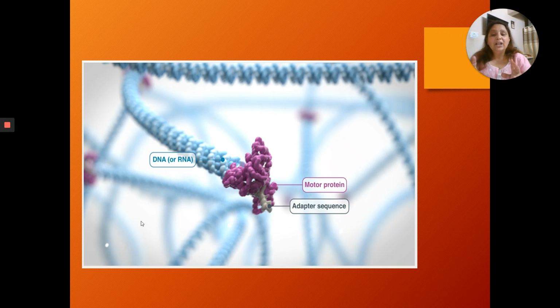DNA is blind. So who is helping in this process? What we have to do, हमें DNA को catch करना है और हमने DNA को बिठाना है एक जगह पे, ठीक है, so that it goes into the nanopore. Second thing is that once this is done, हमने पकड़ लिया उसको, nanopore के पास ले आए.